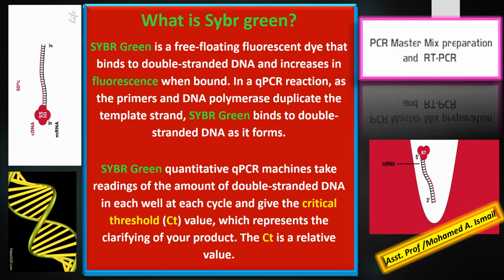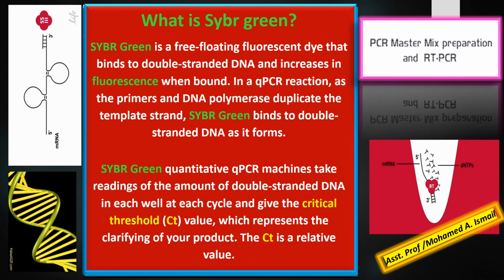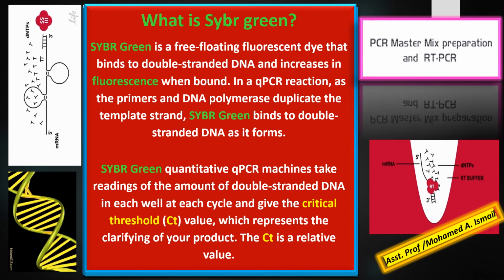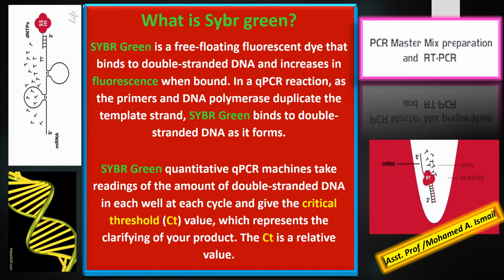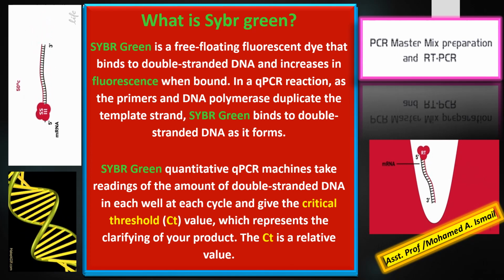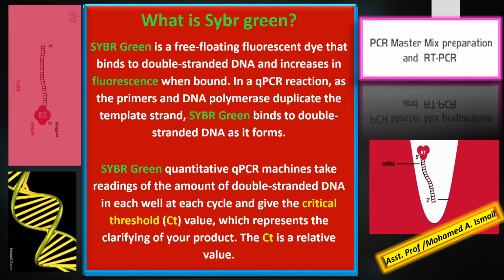In qPCR or RT-PCR, as the primers and the DNA polymerase duplicate the template strand, the SYBR Green binds to this double-stranded DNA as it forms.